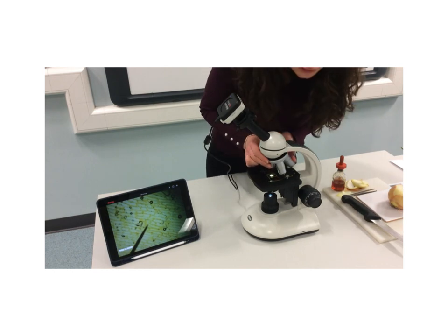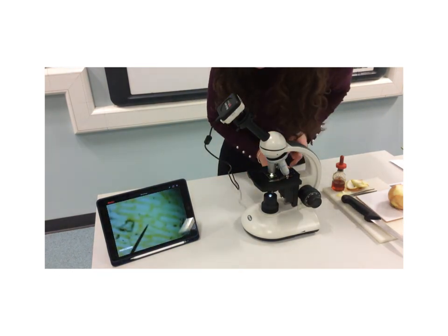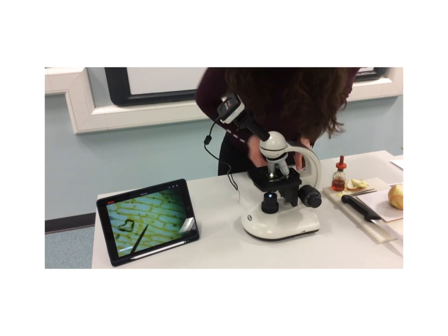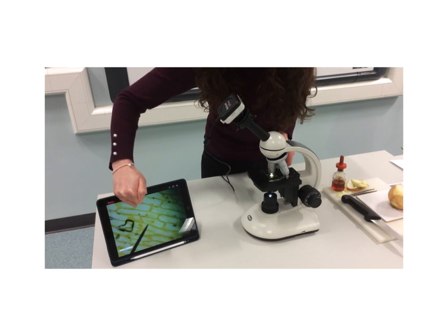I'm going to now turn it so that it's a closer image, and we'll see if we can see anything in greater detail. So I'm just using the fine focusing wheel because you can see, I can see an image, it's just not very clear at the moment. Okay, and hopefully that's a bit clearer for you now. So again, hopefully you can see the cell wall and our nucleus.